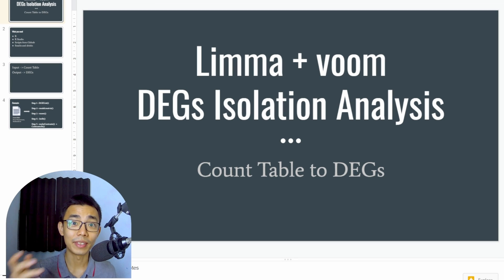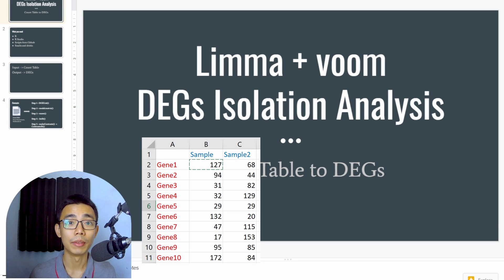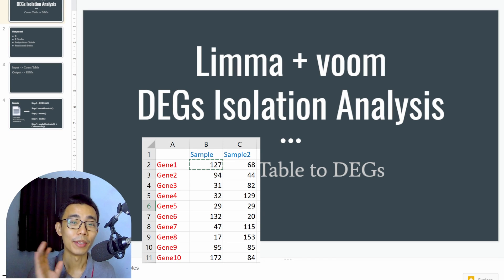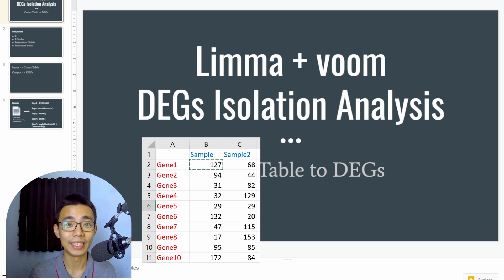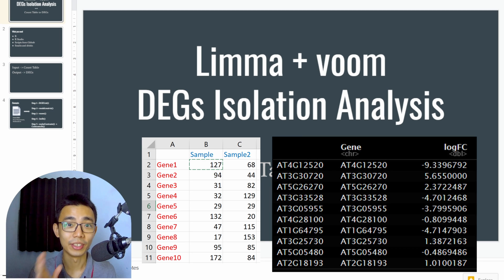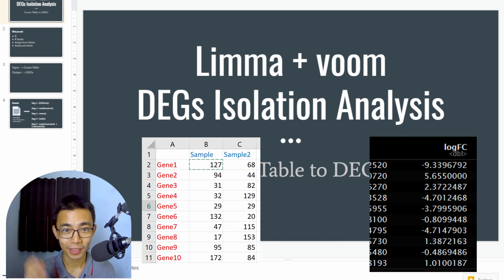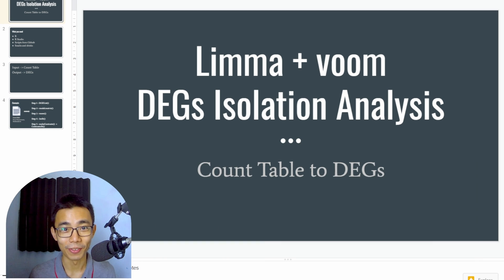If you already have the count table from your analysis pipeline and want to figure out how to do your DEG isolation using the limma-voom pipeline, this is the video for you.